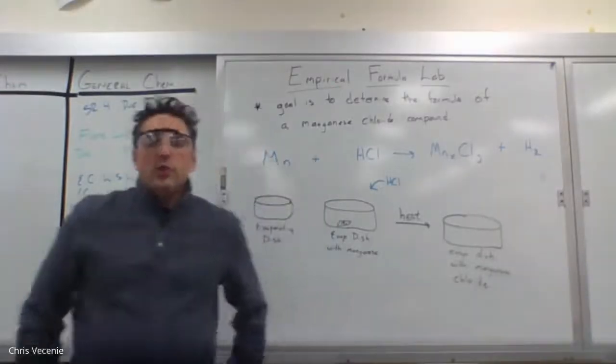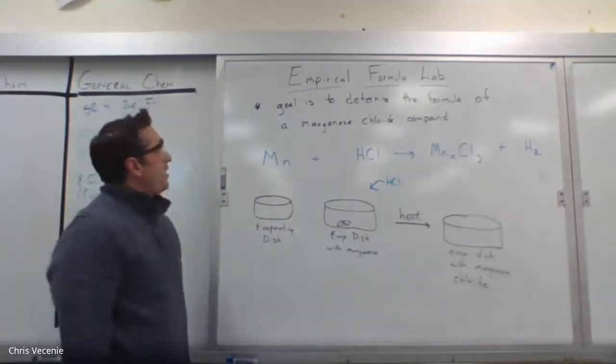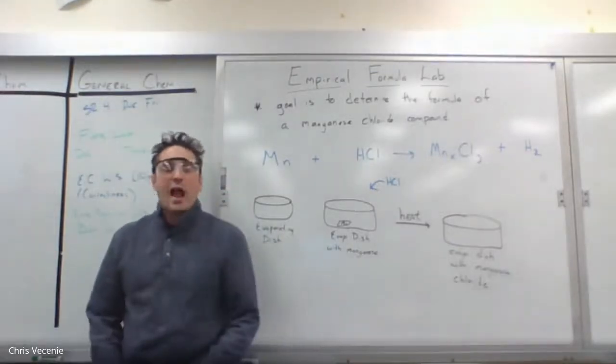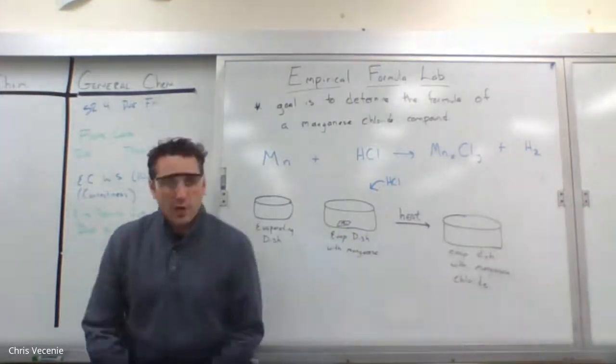Hey, guys and girls. So, want to get you guys back into the lab again, all right? And the theme of today is, what does an empirical formula lab look like? How do they figure out the formulas of some of these compounds that we've been talking about?